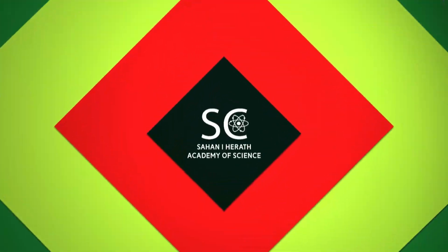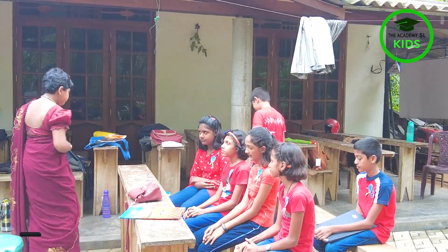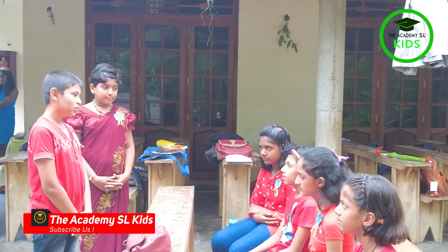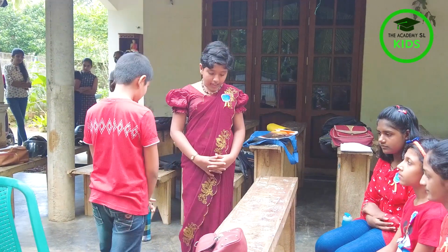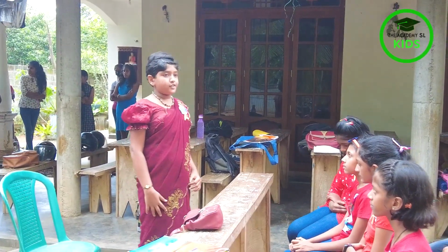Now, what about you? Can you explain to us what is called the light compound microscope? The compound microscope is made of two convex lenses. It is called the compound microscope, and it is also called the light microscope because the light is used. Excellent, Younger. Okay, now let's see the parts of the compound microscope.